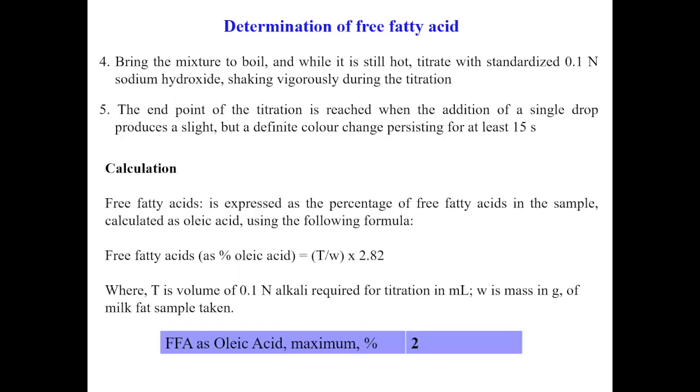Now bring the mixture to boil, and while it is still hot, titrate with standardized 0.1 normal sodium hydroxide, shaking vigorously during the titration.